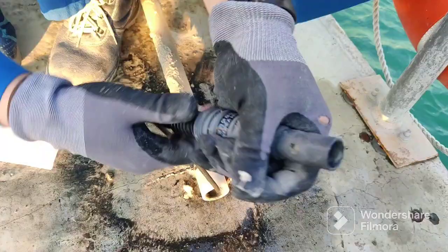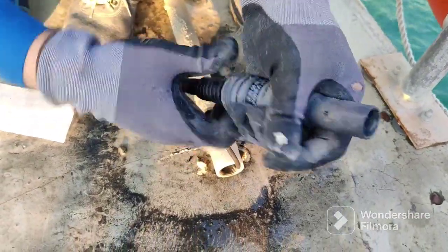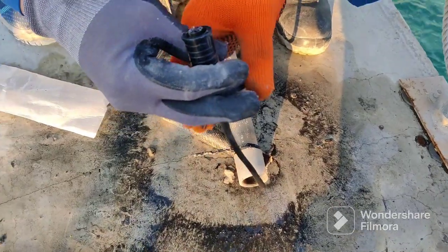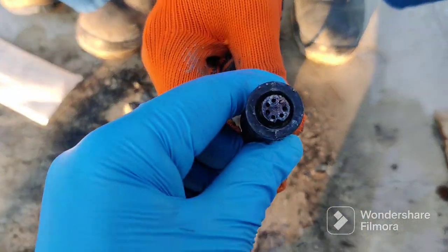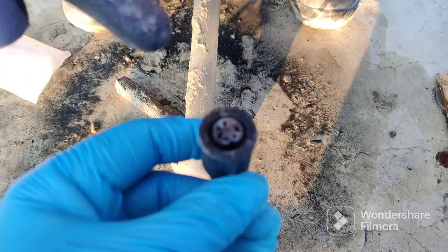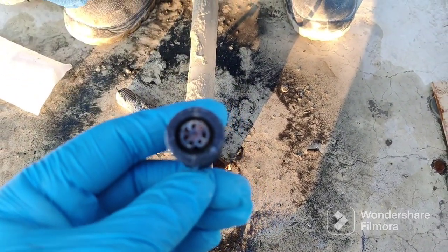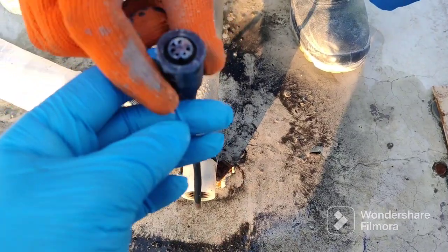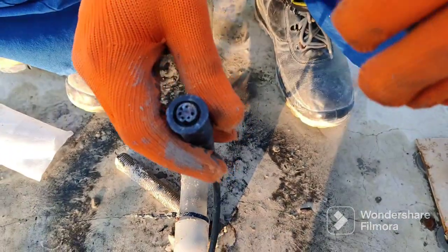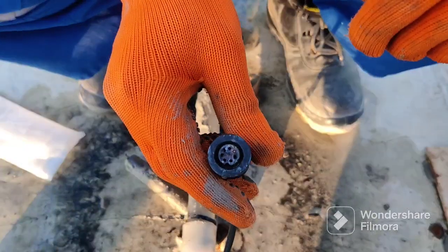This is the top cap of the base. You can rotate it — once you rotate it will be easy to remove. One pin is stuck inside the conductivity sensor and one pin is broken inside. Now we will remove this one — be very careful. Once we remove this, we can connect the other conductivity sensor.